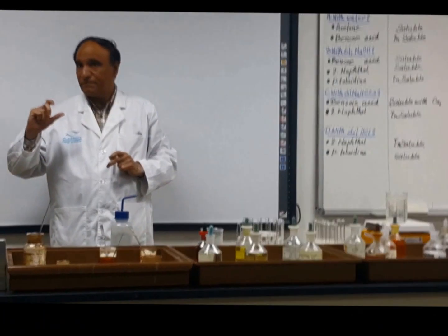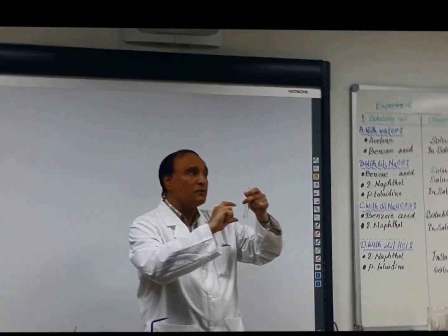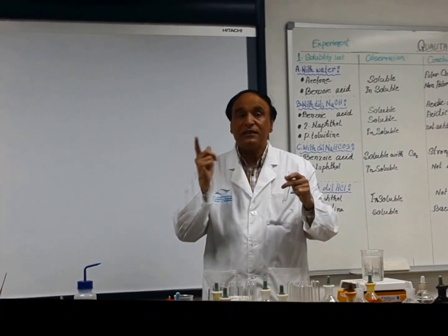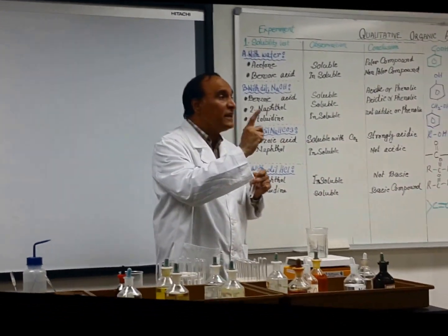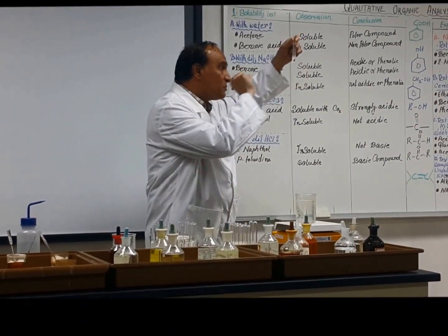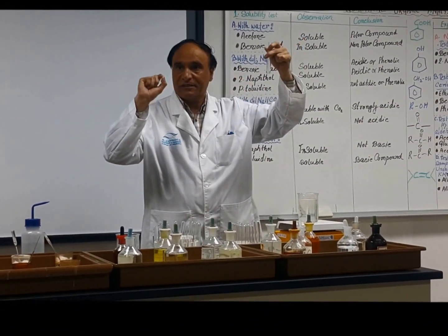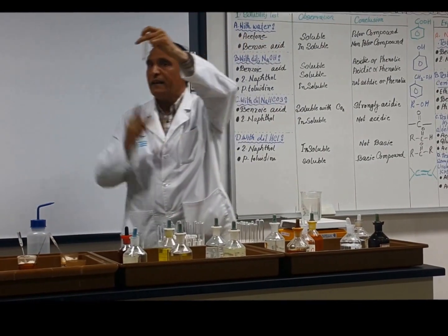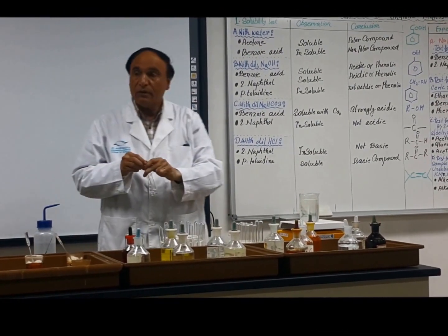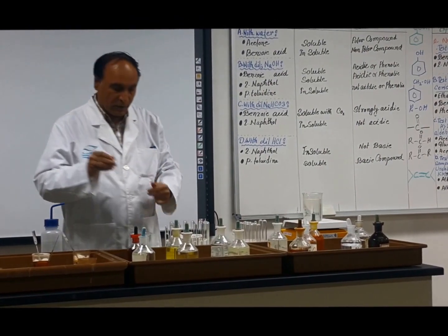Yes, but if you take a large amount of sugar and less water, it will not dissolve. So you must be very careful about the quantities. Look how much I am taking, very small, only a few crystals. Then you add water and you see that it does not dissolve. So we will say it is non-polar.